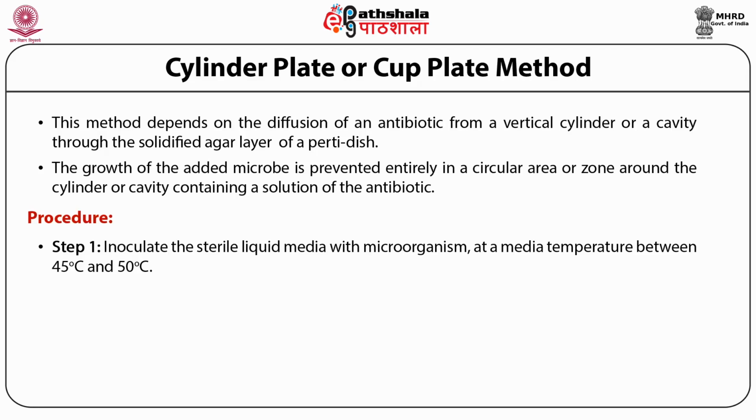Inoculate the sterile liquid media with microorganisms, that is, the test microorganisms specified as per pharmacopoeia, at a media temperature between 45 degree centigrade to 50 degree centigrade so that the microorganism will remain live.